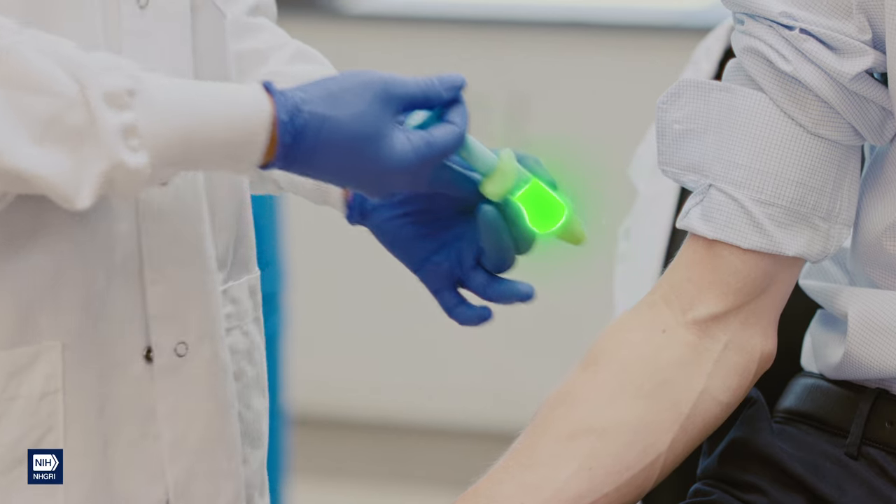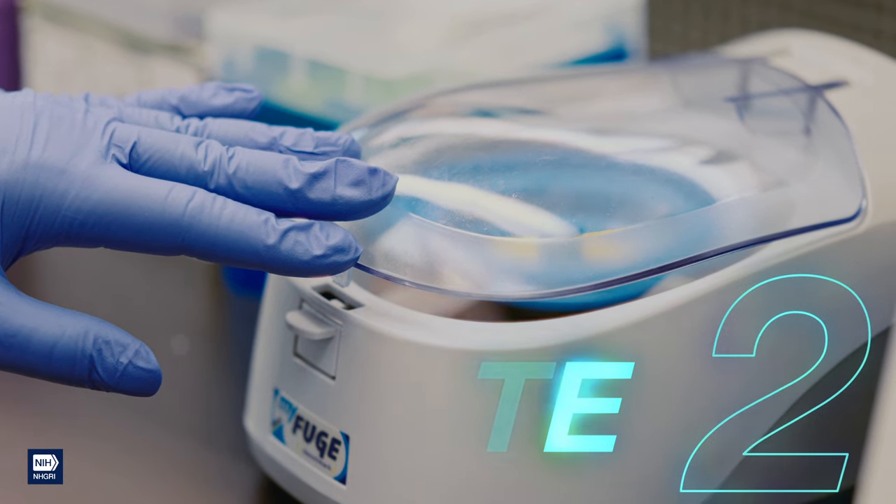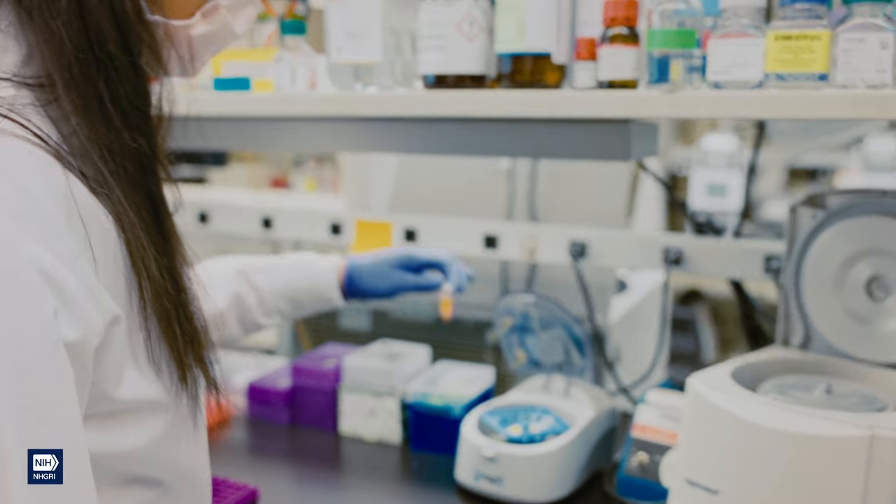Maybe you want to sequence yourself. Step 2: Isolate the cells by centrifugation — that's a scientific word for spinning something around super fast to separate the contents.